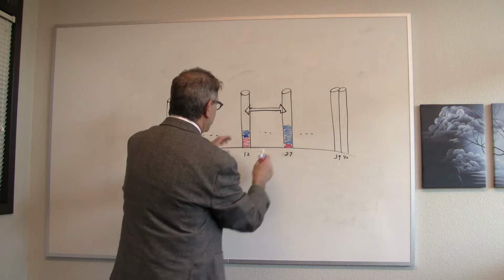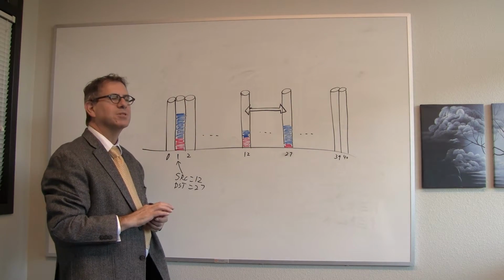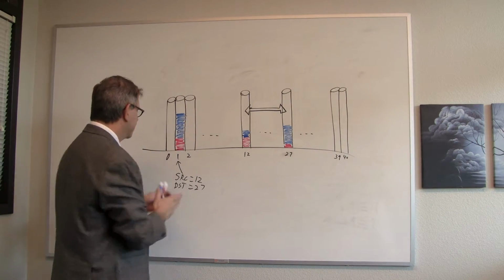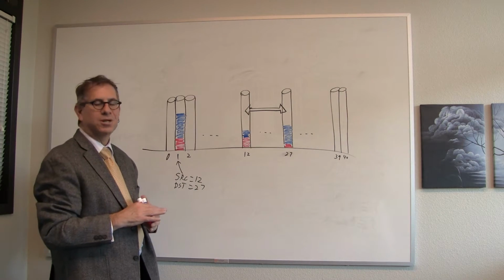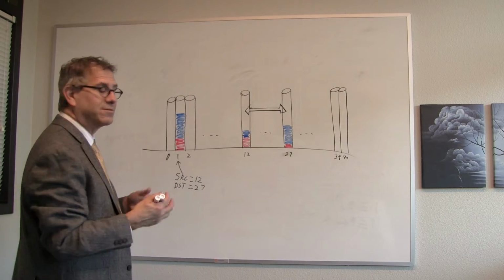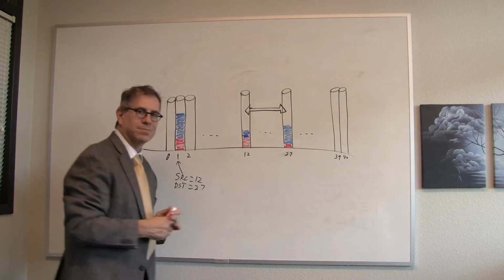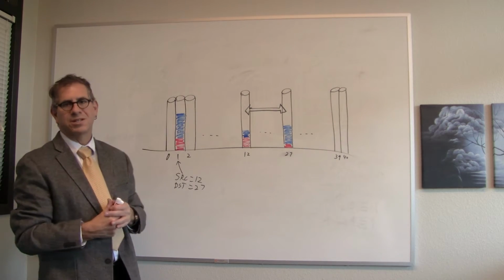And so, if we have the same amount of fluid in both sides, the same amount of source on both sides, the same amount of destination on both sides, then this becomes a no-op. No transfer takes place. And as I said, that's one way to do this. We can have another version of this where we actually say, take chemicals from here and transfer them to there because of the source destination.